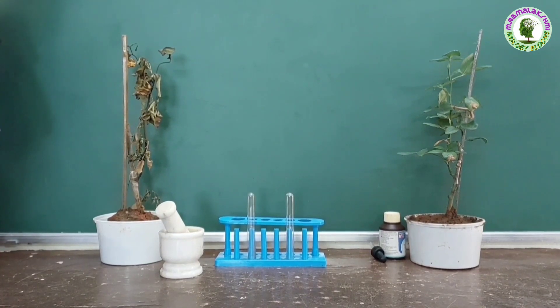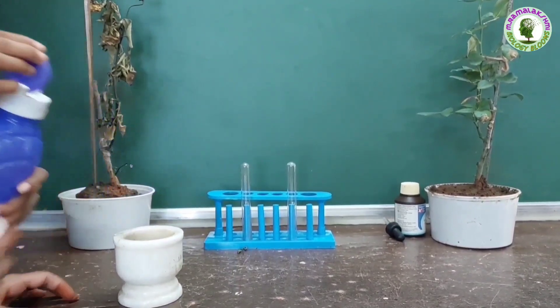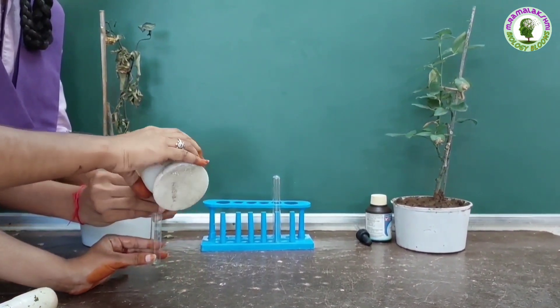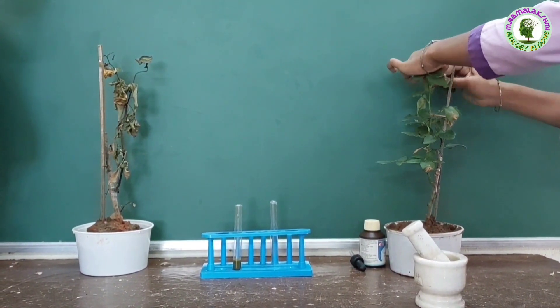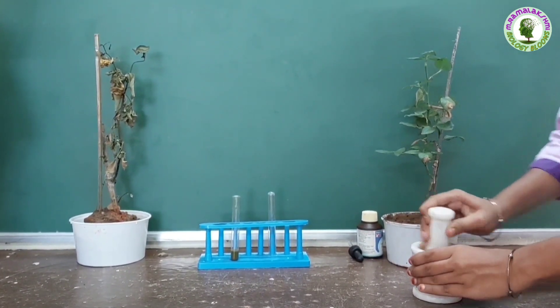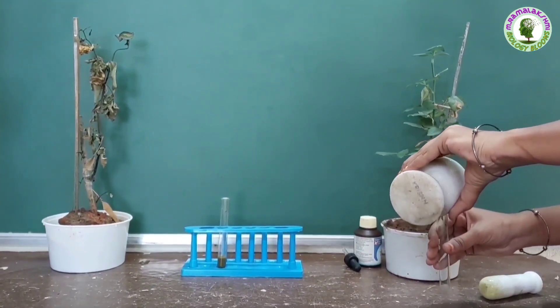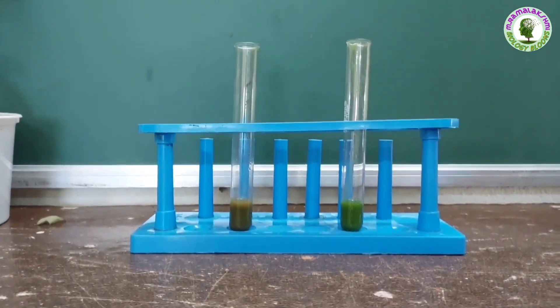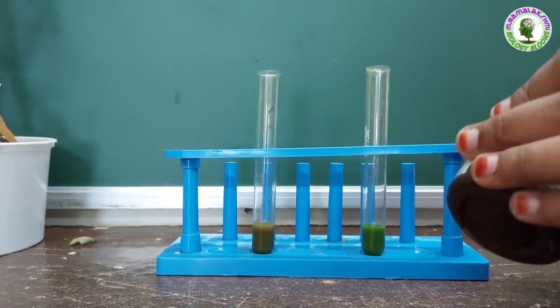Now, take some leaves from the plant kept in dark, add a few drops of water to it, and mash them to make a paste to get the extract. Collect this leaf extract into a test tube. Similarly, take some leaves from the plant kept in sunlight, add a few drops of water, mash them to get extract, and collect it into another test tube. Take equal amounts of leaf extract from both plants in two test tubes for better observation.